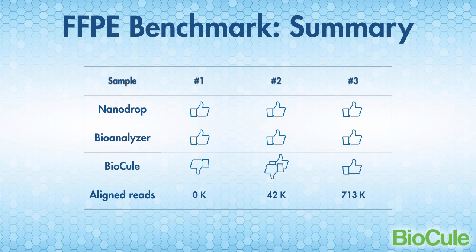We then proceeded to use these samples in a real-world test. They were used to generate sequencing libraries using the Illumina TruSeq cancer panel, which was then sequenced on a single MiSeq flow cell. Based on the number of aligned reads generated with these three libraries, we can see that the first sample is a complete failure, with no aligned reads being generated. The second sample, while not a complete failure, was only able to generate 42,000 reads. Of the three, only the third sample produced satisfactory results, with over 700,000 aligned reads from the cancer panel.